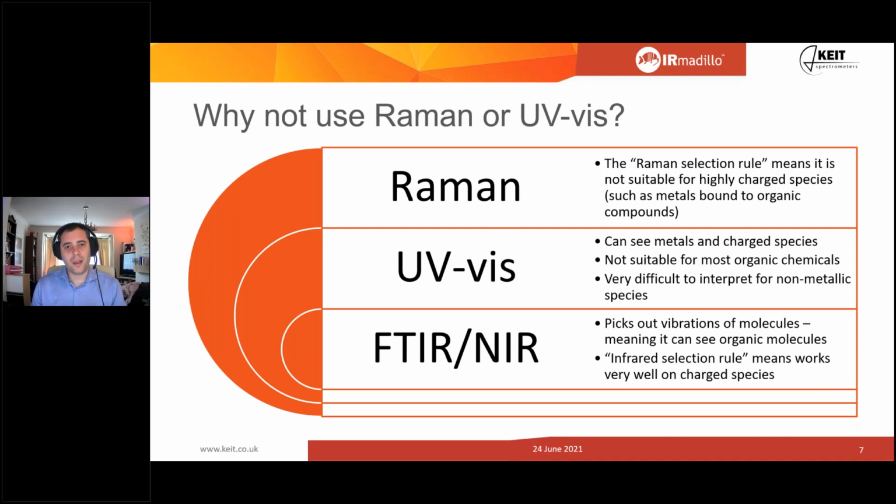If you look at the structure of a triglyceride, we've got the very highly polarized bonds in the carbonyl group of the ester. In a fatty acid methyl ester, it's the same thing, just without the glycerol group. We've just got the discrete methoxy groups. Alcohols, polarized charges at the end in the alcohol. A lot of these molecules, phosphorus, phosphates, if you're looking at that, I'll talk about those in a minute. Phosphates, highly polarized. They're not really very good for Raman. The selection rule, you could probably make a Raman instrument work, but you'd be trying very, very hard, and you'd be throwing an awful lot of effort at it when there are other technologies that just do it naturally.